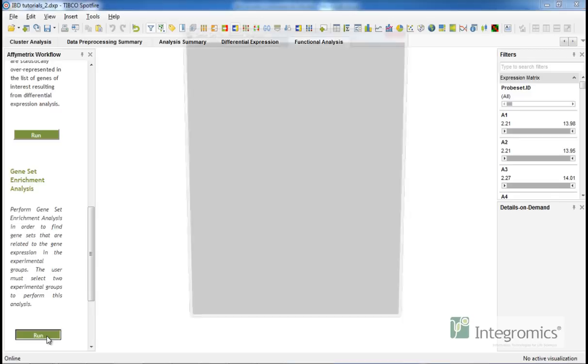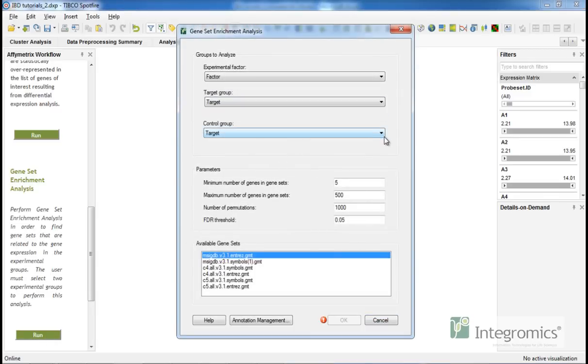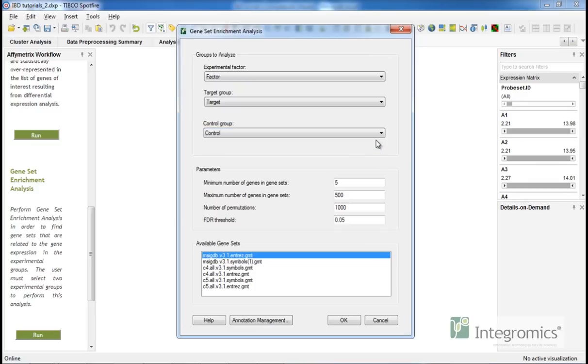we just need to select our target and control groups and also define the minimum and maximum number of genes from a gene set that must be present in the dataset to be included in the analysis.